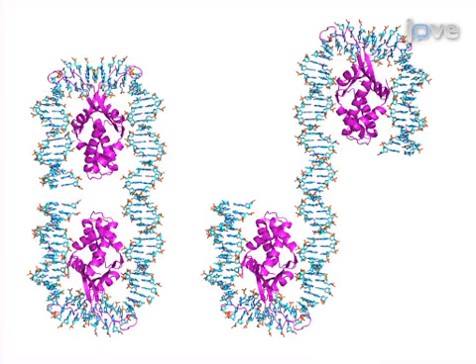Ultimately, the 3DNA tools are used to examine how individual base pair steps, including those bound to drugs and proteins, contribute to the overall folding of DNA and to identify the sites and directions of sizable global distortions.